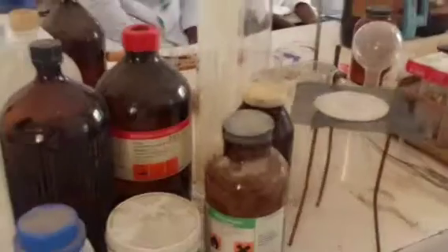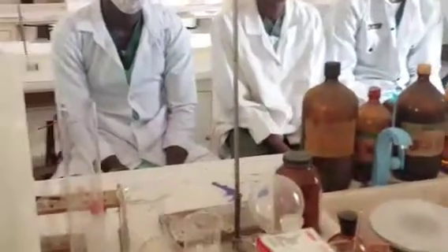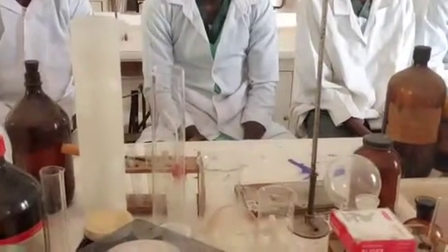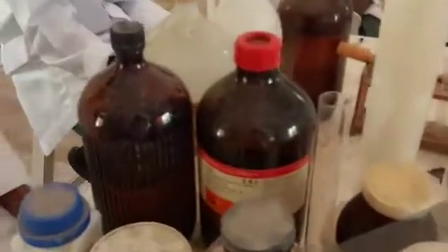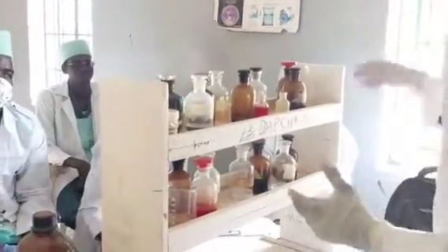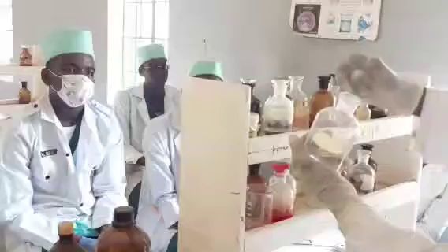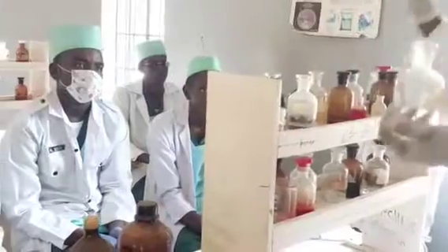So these are the general precautions to be taken. And let us see one or two of the precautions to be taken when using the apparatus. Never touch, taste, or smell any reagent. Let's say we are in the lab now. All these are chemicals, and even though they are labeled, you are not the one that prepared them. It is written dilute hydrochloric acid, and you say, let me open and taste it also. You should not even touch. If you are not the person that prepared it and kept it, don't even touch.